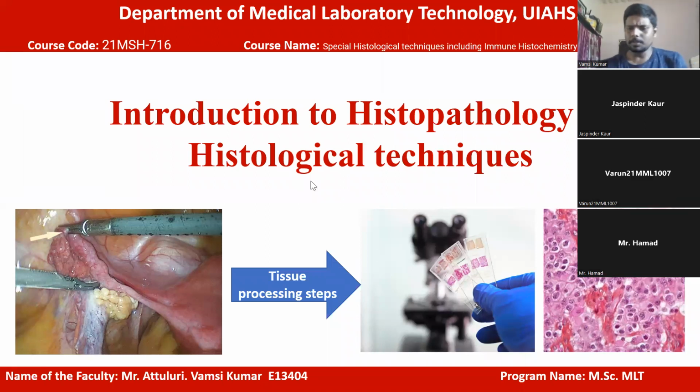So in classical histopathology, we will take the biopsy or autopsy. Biopsy is from a living patient and autopsy is from a dead body. Upon taking a piece of tissue, we will convert the semi-solid or gelatin-like tissue to solid tissue. Then this solid tissue will be cut into slices with a specialized instrument called a microtome. Upon getting the slices, we will stain them and observe them under the microscope. That is the primary agenda of histopathology.